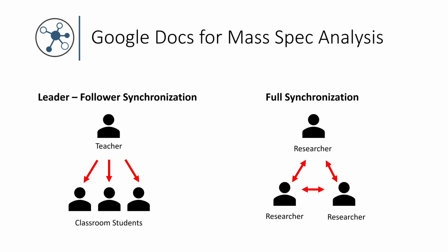And then the second one that is even more exciting to us is this full synchronization. So this really embraces the Google Docs paradigm. You can imagine a set of 3 researchers in this particular example. They're all sitting in different parts of the world. I actually was analyzing some data with Peter and Danny while on an airplane coming back from ASMS. So that was kind of fun.